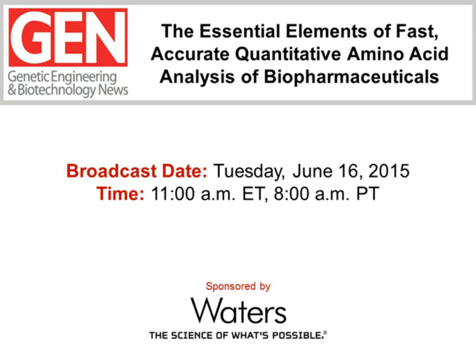It's entitled, The Essential Elements of Fast, Accurate, Quantitative Amino Acid Analysis of Biopharmaceuticals. Amino acid analysis is a critical and necessary function in quality control and process monitoring operations. It also has applications in protein and peptide identification and in the quantitation of a biotherapeutic API and finished drug product. Today's webinar has been designed to demonstrate how the use of two innovative technologies, ACQUITY UPLC and AccuTag Ultra chemistries, can greatly enhance researchers' abilities to accurately conduct the quantitative amino acid analysis of biopharmaceuticals.